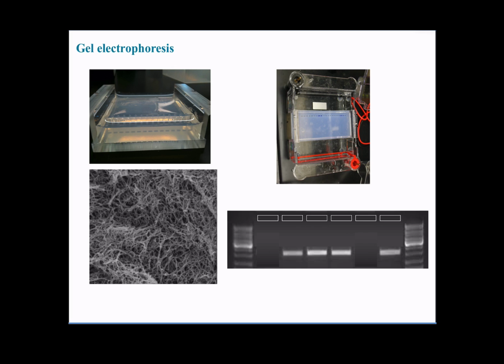Yeah? So once again, and based on what we were discussing before, generally when you're looking at the gel from the point of view of the wells, the smaller a DNA fragment, the faster it will migrate through the pores, and the further it will go during that electrophoretic run than bigger fragments that are going to be dragging behind.